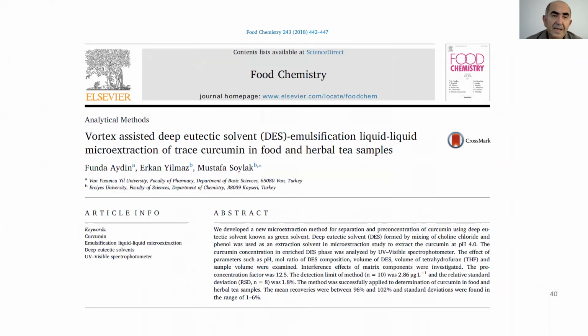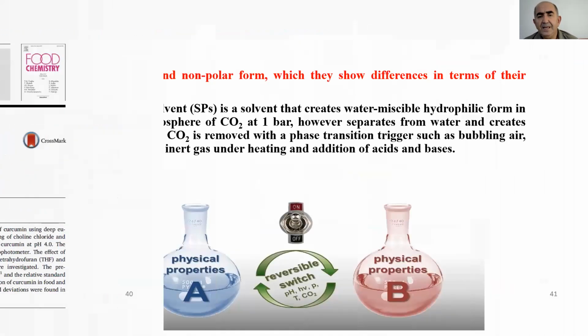And also the application of these kinds of solvents for the microextraction of trace curcumin in food and herbal tea samples. With this procedure, we can get quantitative results for the separation and preconcentration of trace curcumin in food and herbal samples.